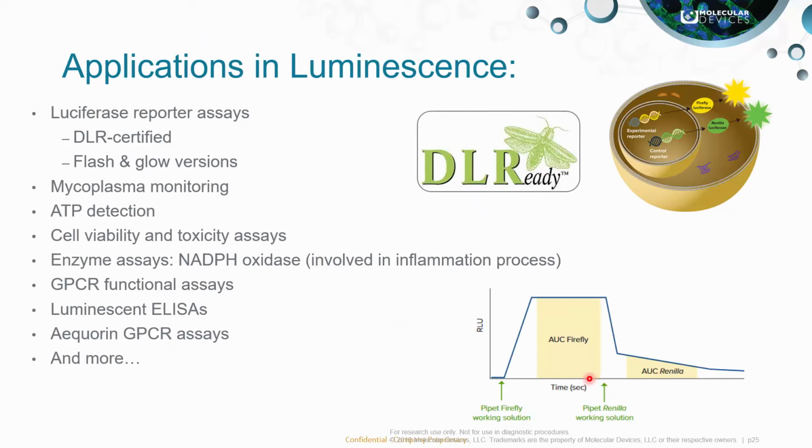One of the advantages of luminescence is that most molecules and atoms either absorb or fluoresce. Not many luminesce. Therefore, the sensitivity of luminescence is the greatest. Here are some of the luminescent applications, where the luminescence ELISA is highlighted here in red.